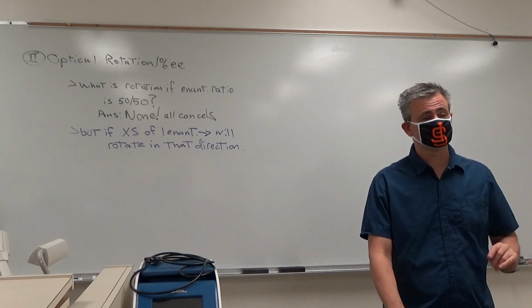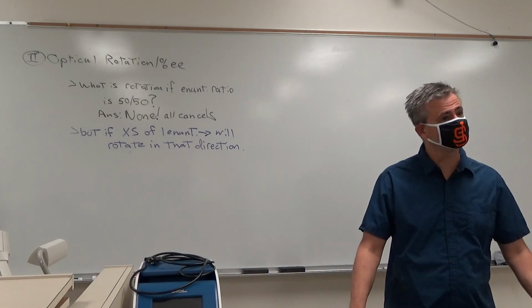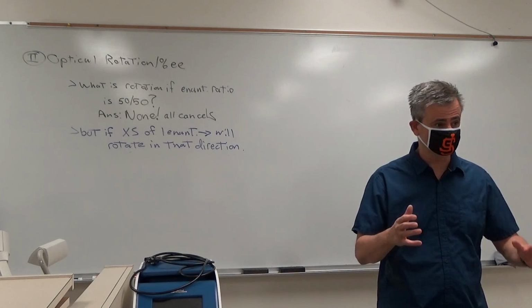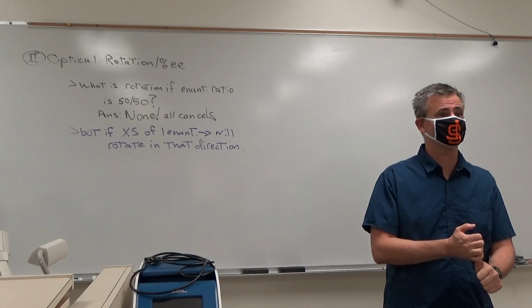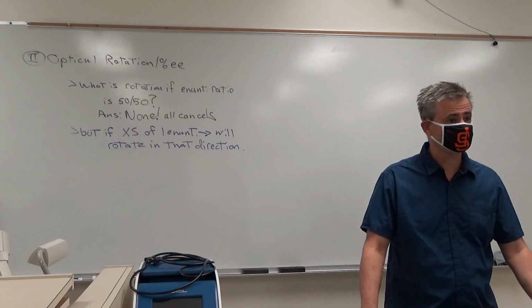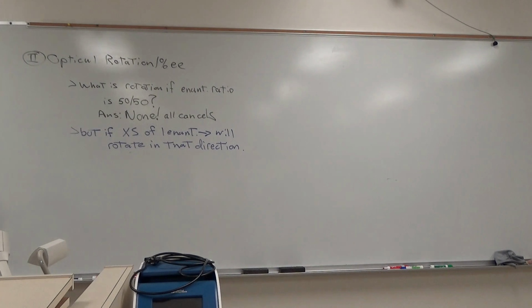And you already know this. What are those simple factors? Think back to when we did methyl violet. We weren't looking at the degree to which something rotated; we were looking at the degree to which the light got absorbed. What were some of the things that affected how much light got absorbed? Because they have the same effect on the rotation of light. I'm light.